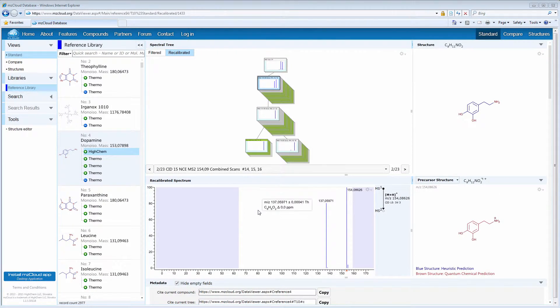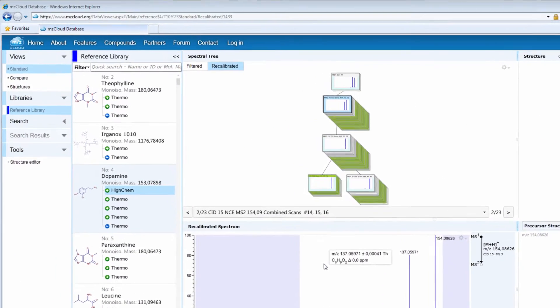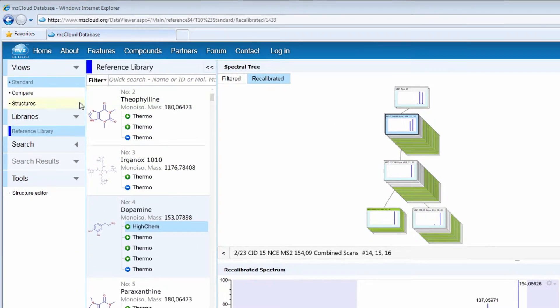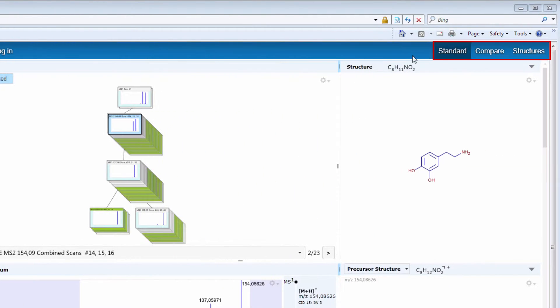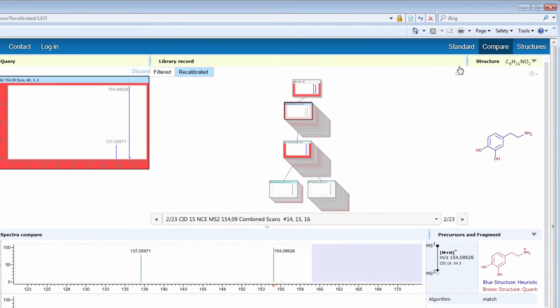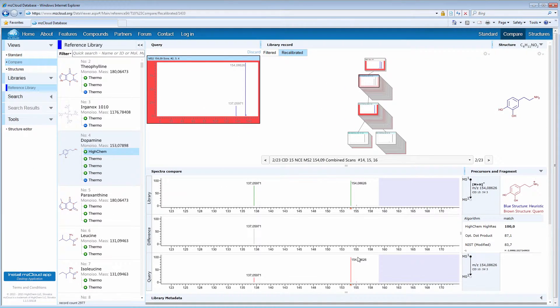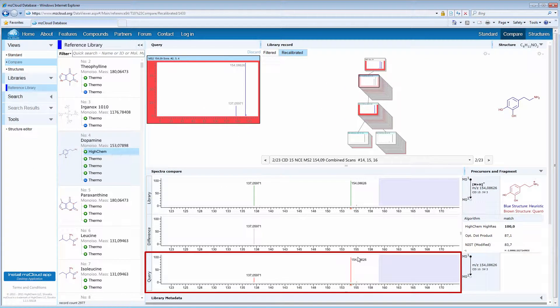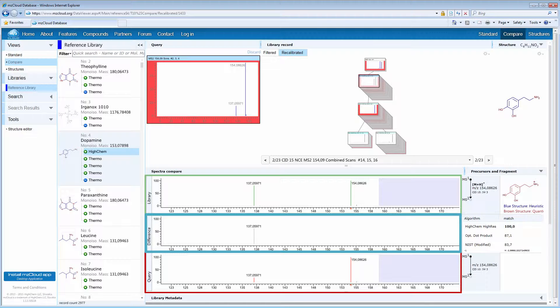MZCloud provides a variety of views, which you can find either on the left-hand side or at the top of the webpage. You can choose Standard View, which I am using right now, or you can choose Compare, which compares the user-selected query spectrum against the active library spectrum, and the difference is shown in the middle spectrum.